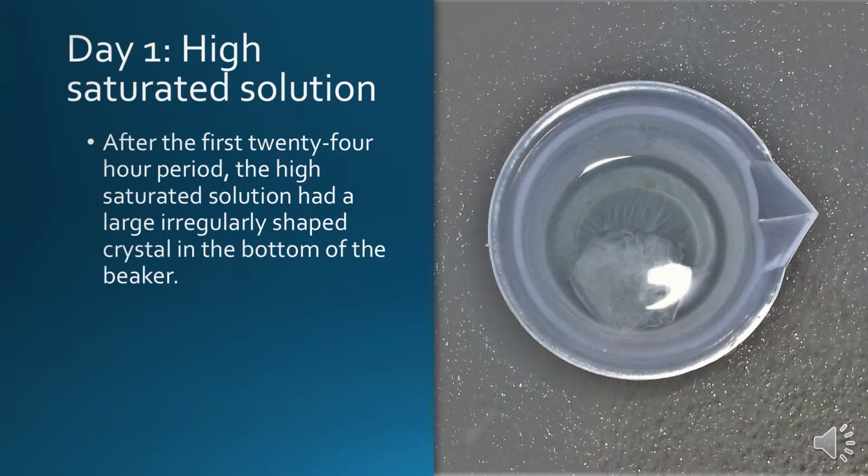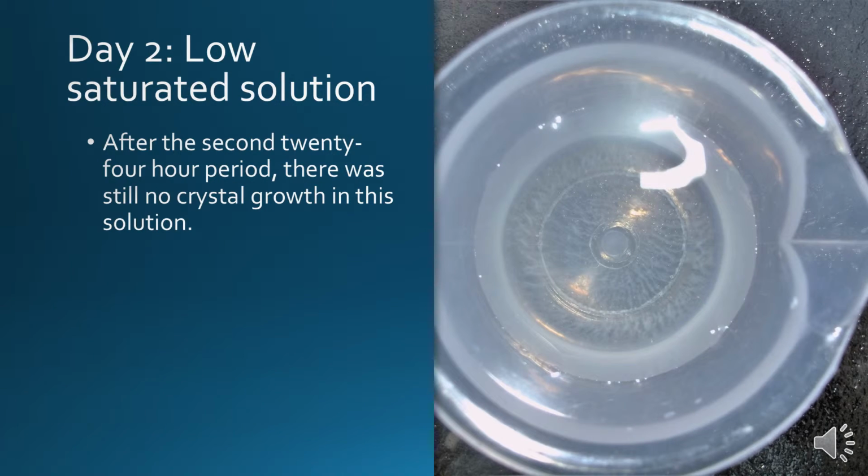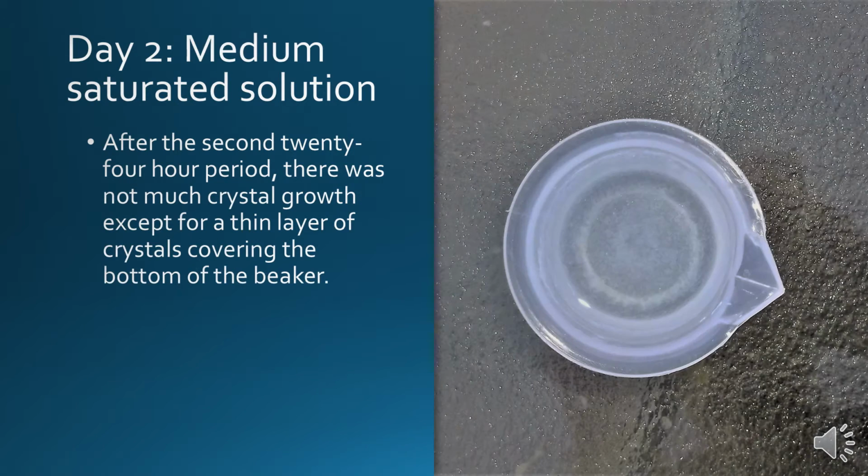Day 1, high saturated solution. After the first 24-hour period, the high saturated solution had a large, irregularly shaped crystal in the bottom of the beaker. Day 2, low saturated solution. After the second 24-hour period, there were still no crystal growths in this solution.